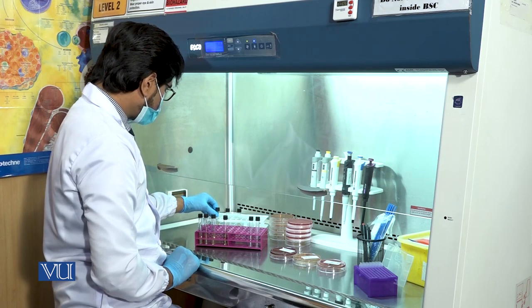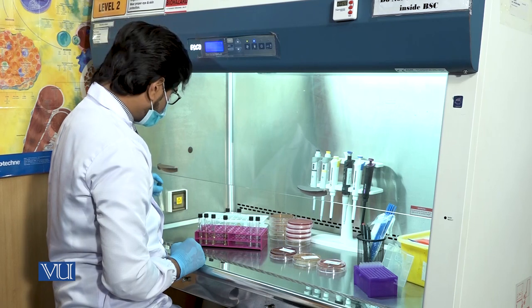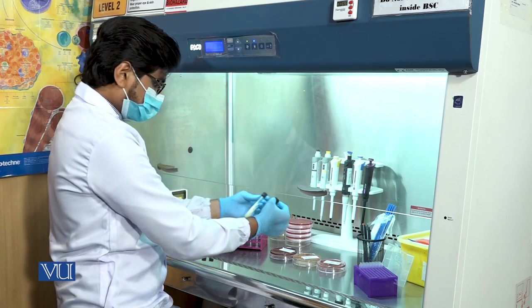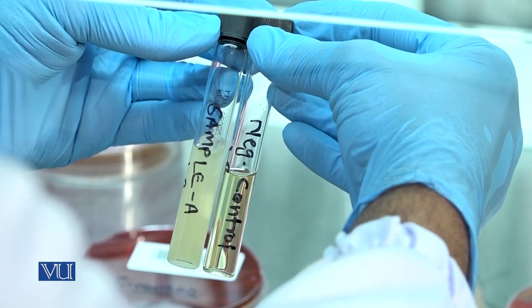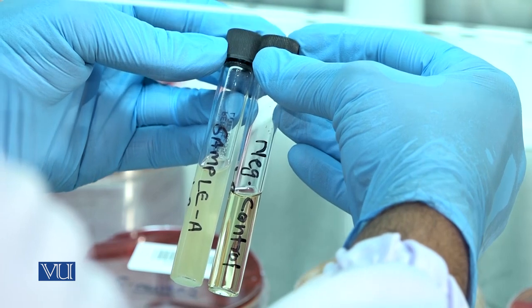Incubate bacterial culture at 37 degrees Celsius for 12 to 18 hours in a shaking incubator. After incubation, check for growth, which is characterized by a cloudy haze in the media as shown here.